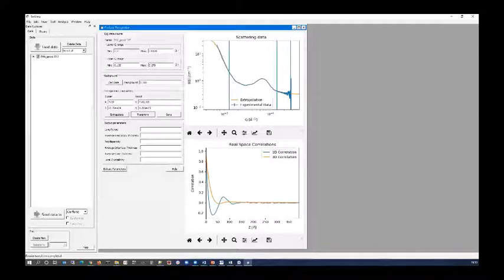If your sample is lamellar, or at least quasi-lamellar, then you can go a step further, because there are various publications that look at the slopes of these correlation functions and the positions of the peaks in them and the positions of the minima, and use those to interpret things about the quasi-lamellar structure.